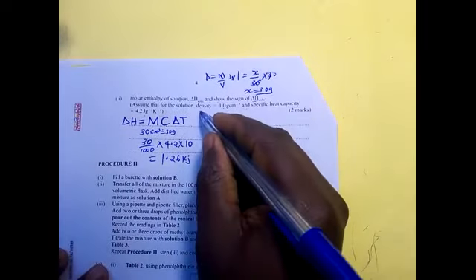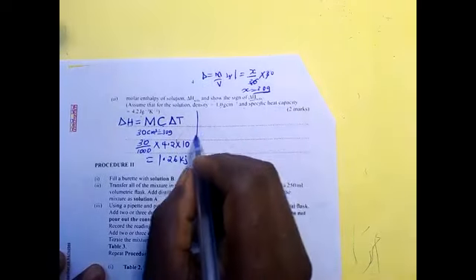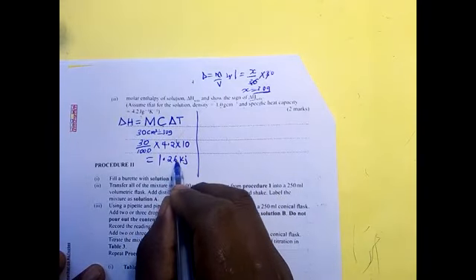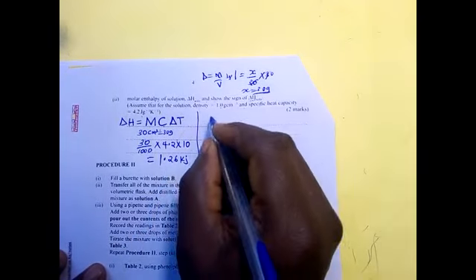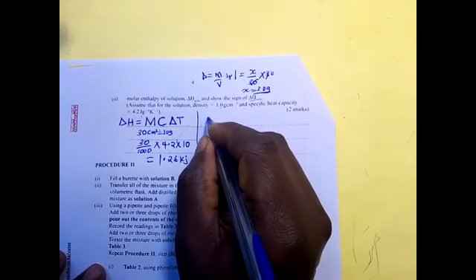Right? Now the next one, we want to calculate the molar heat of solution. So how do we know that this is the heat that was produced by 0.05 moles of the solid A?